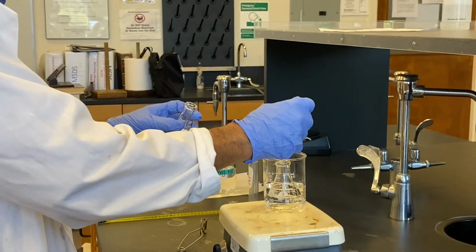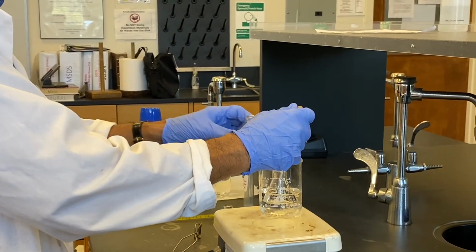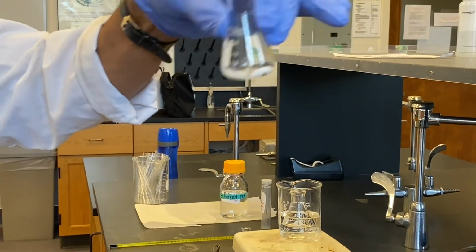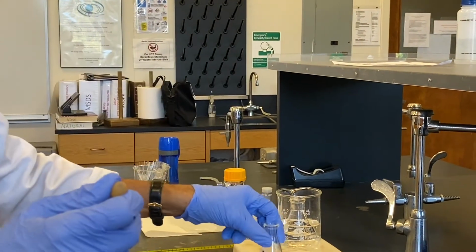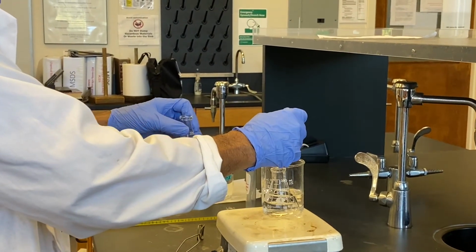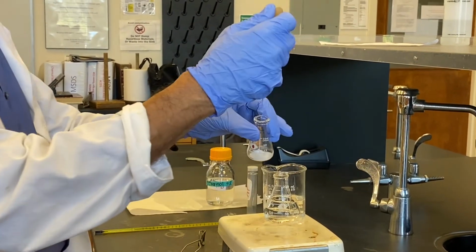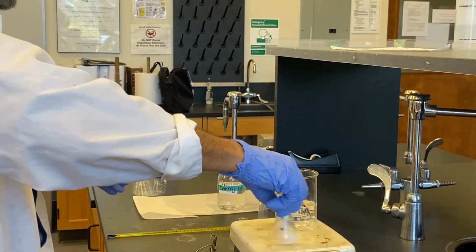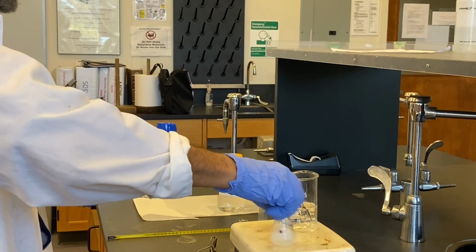So first let me add this alcohol a little bit. You have to dissolve in a minimal amount of alcohol, at boiling temperature, right? Yeah. So I'll add 1 more ml. Let me see whether it can dissolve. Okay, as you add it, it cools down, so you have to warm it up again.